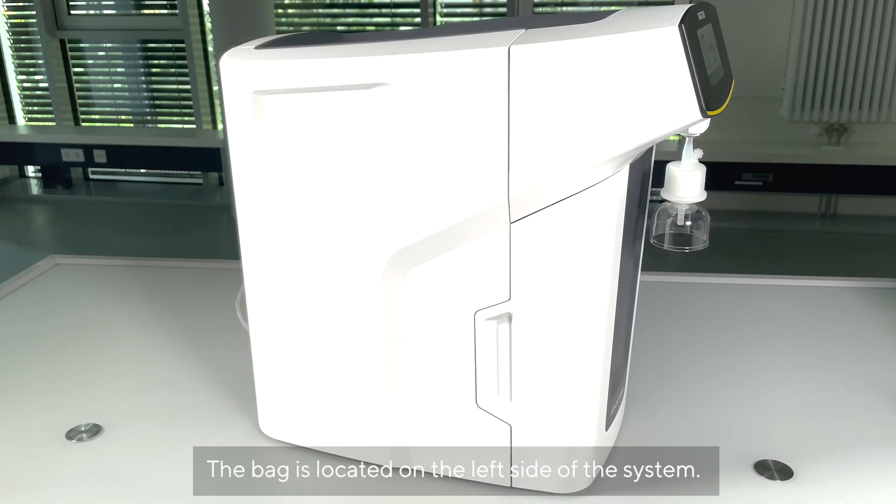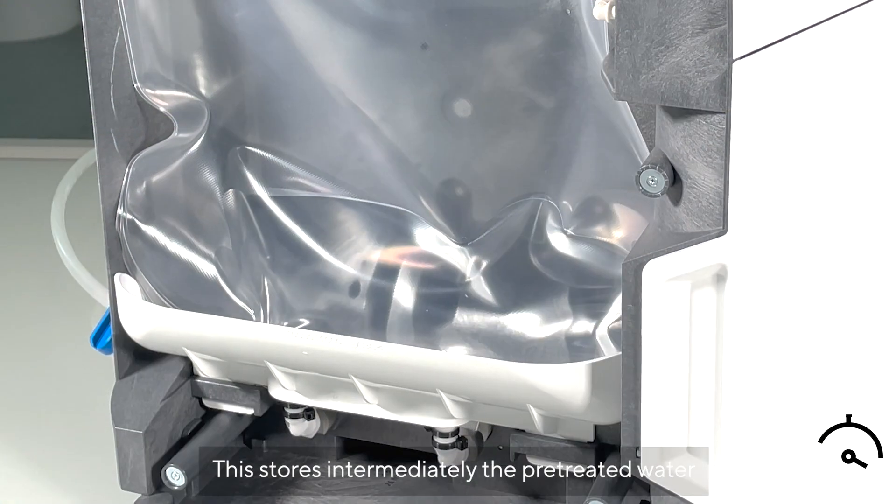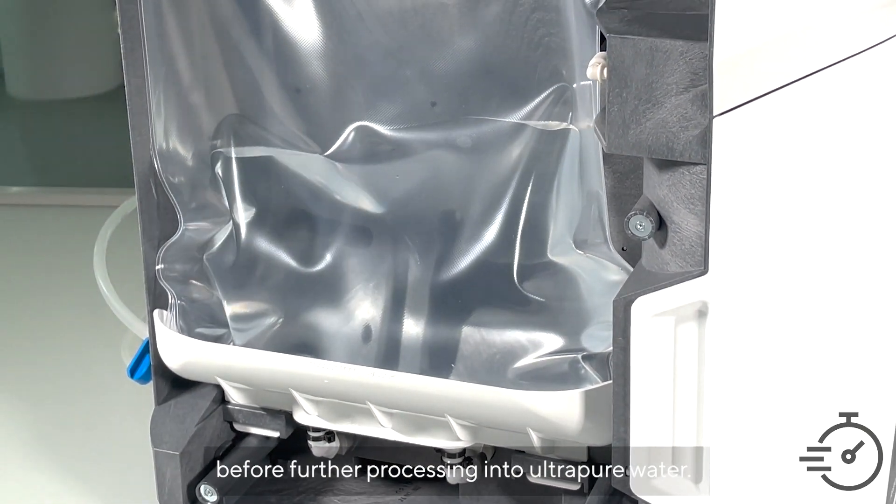The bag is located on the left side of the system. This stores the pre-treated water before further processing into ultra-pure water.